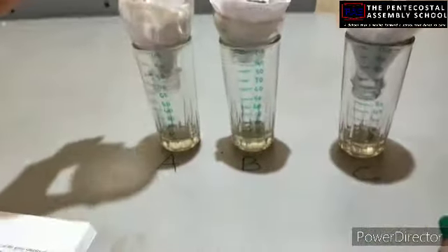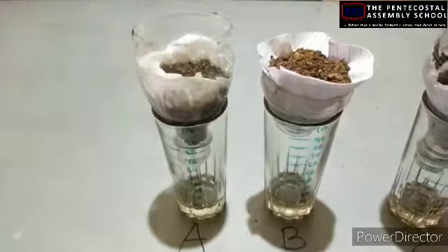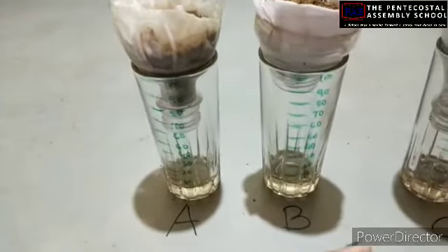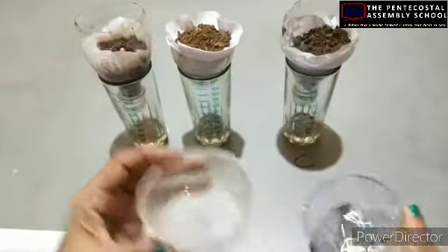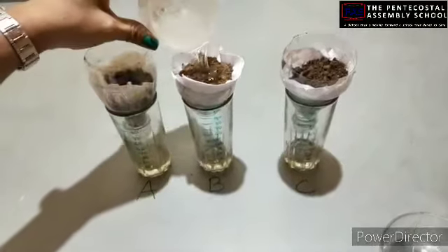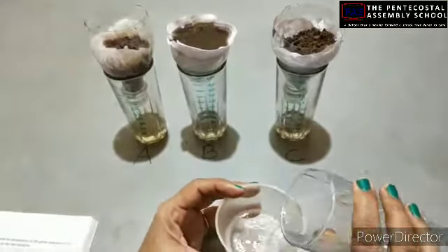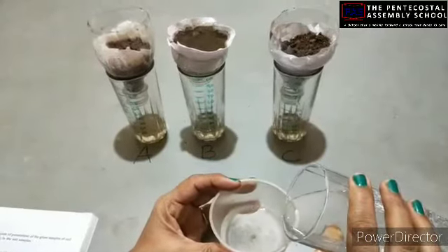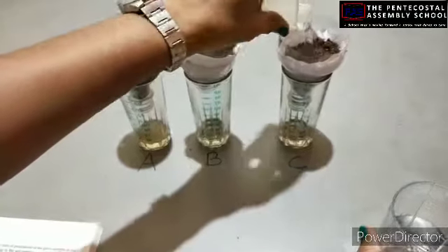Okay, so I am putting this in sample A. In the same manner, we take another 40 ml for sample B and for sample C.